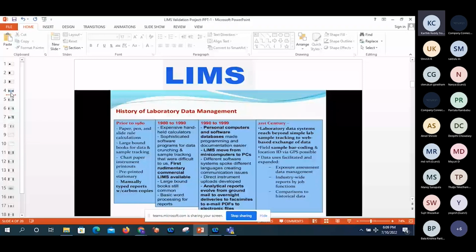In the 21st century, over the last 25 years, there has been a huge demand coming from the regulatory industries, like the FDA (Food and Drug Administration), Health Canada, MHRA, and TGA, whatever is available in the current regulatory industries. They are asking that paper-based methods should not be used. Why? Because of manipulation. People can do so many things, so the auditors do not trust it.